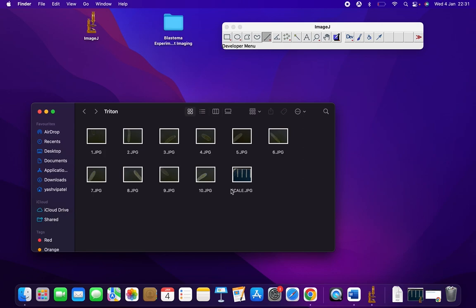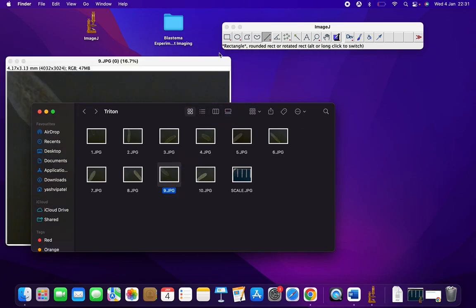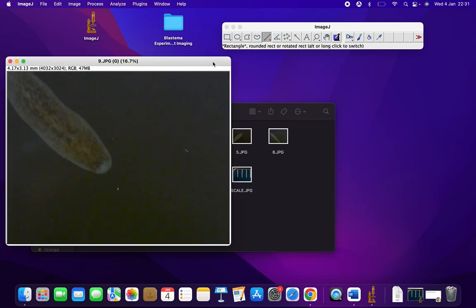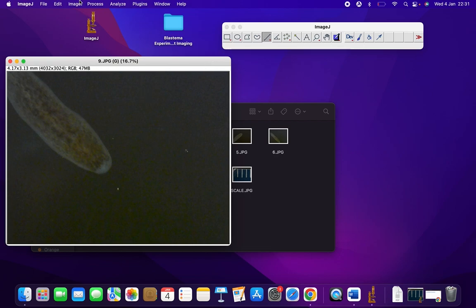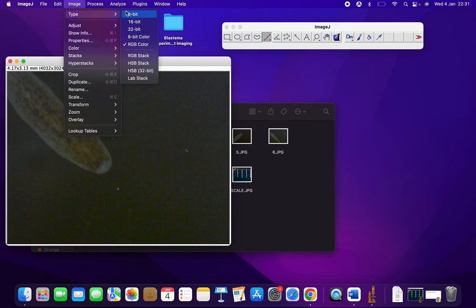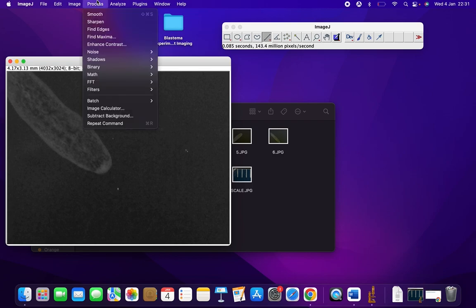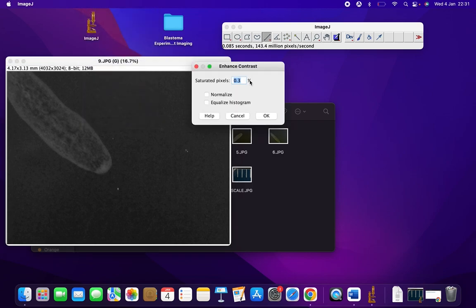Then we are going to use the image and drag it into ImageJ to open it. As the image is in RGB, we will do Image > Type > 8-bit. You need to convert it to black and white, and then we're also going to Process > Enhance Contrast.